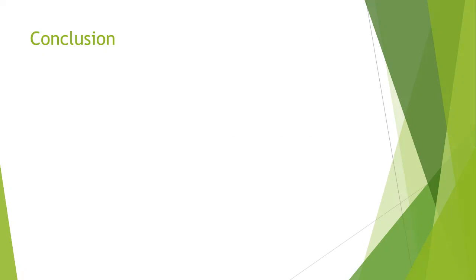Conclusion. In the end, we were able to create this code that shares the idea of bringing computers and software into the chemistry lab environment, especially first-year engineering labs. Our code is only a sample of a much broader idea which can actually be valuable to invest in for future generations. In order to help first-year students take more out of their chemistry laboratory, we can provide this code so that they can do their laboratory experiments in a much more orderly and organized fashion.